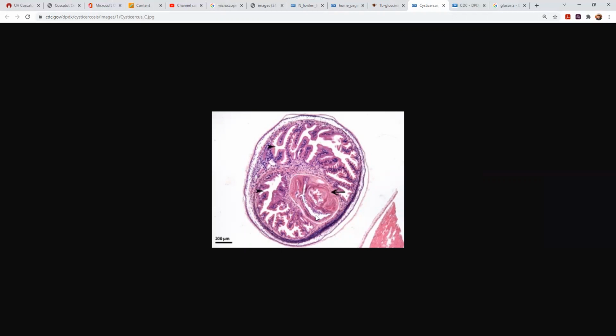Now, this is going to be different than a regular tapeworm disease, because this can migrate to the brain and cause a disease called neurocysticercosis. And we primarily see this with Taenia solium rather than Taenia pisiformis or Taenia saginata. But what you're seeing here is essentially this form of the worm, and this arrow is pointing to what would become the scolex if this was to hatch out of this form. So that's lab 25, diseases of the nervous system.